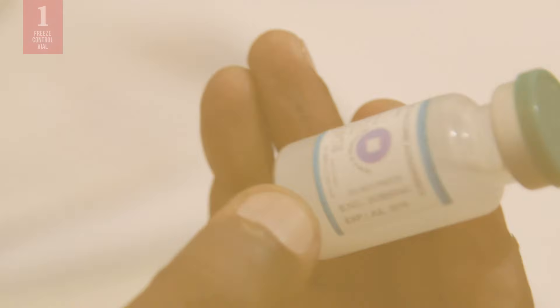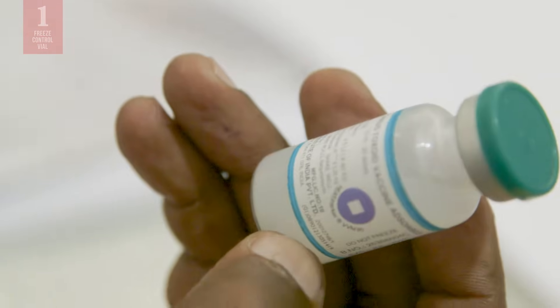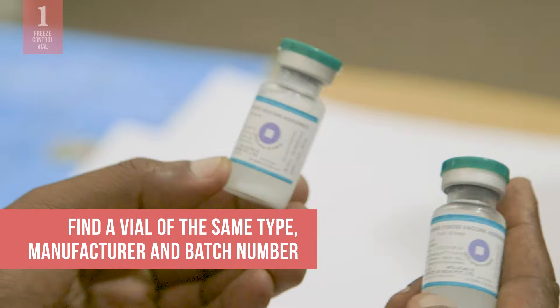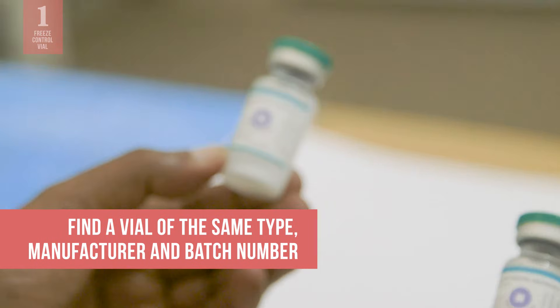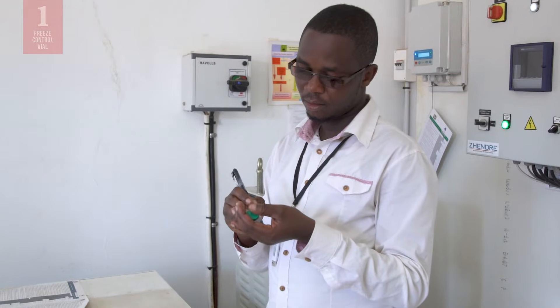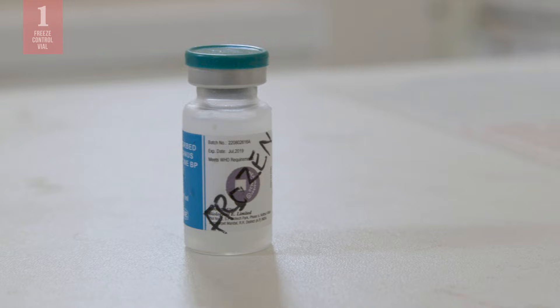The vial you suspect was frozen is your test vial. Find a vial of the same type, manufacturer, and batch number as the vial you want to test. Clearly mark the vial frozen — this is your control vial.